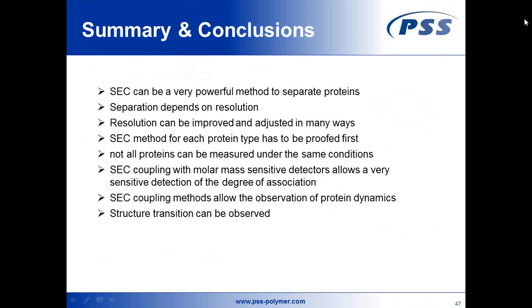Not really. As long as they are equal in size, they would elute at the same time. In order to get this question answered, I would not use SEC. I would use a different technique, maybe liquid adsorption chromatography under critical conditions, and then you could answer these questions as well. Measuring two different antibodies that only differ in the functionalization will not work with the SEC.